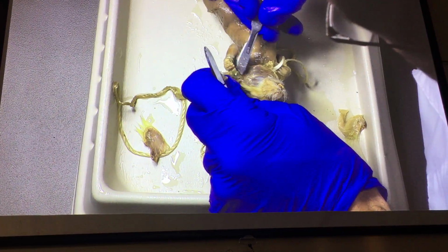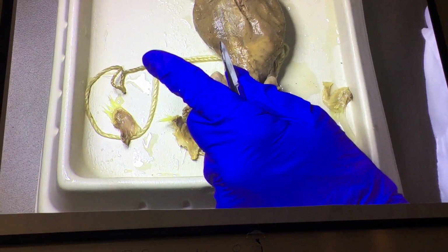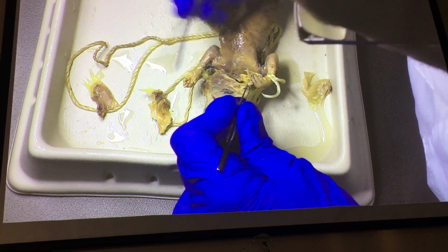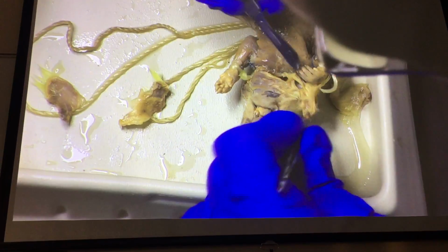Well. Anyways, the lower jaw is actually in two pieces, and that way they can move it forward and back as well as side to side. So one of the differences we're going to see is that the digastric muscle is superficial to the mylohyoid in rodents. It's not that way in most other mammals.